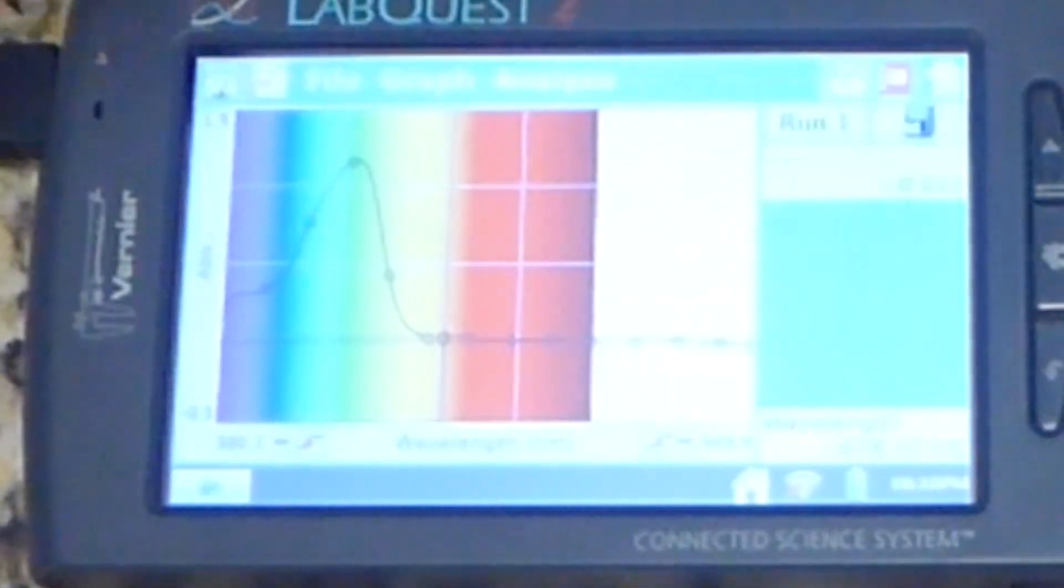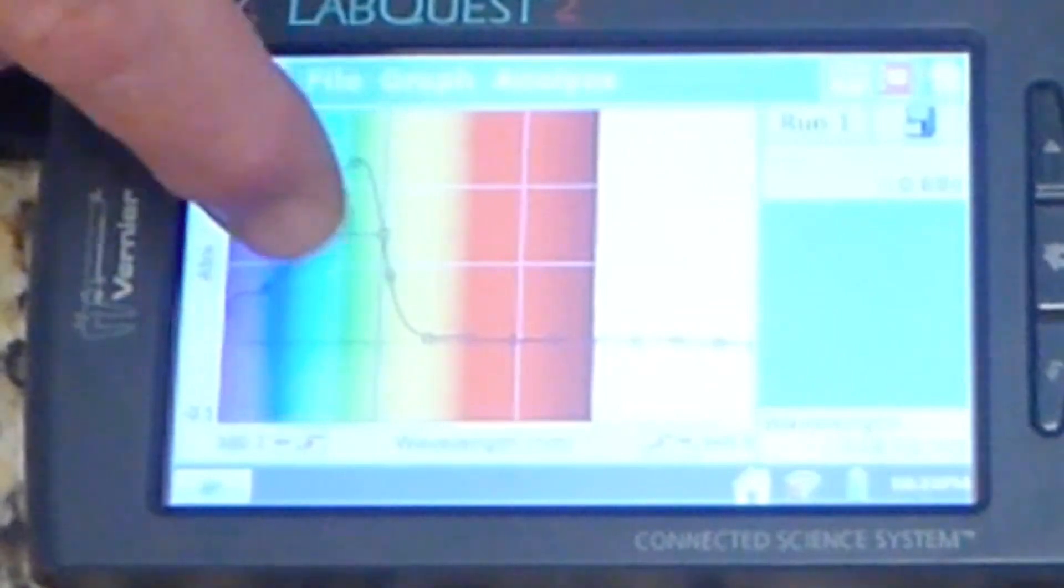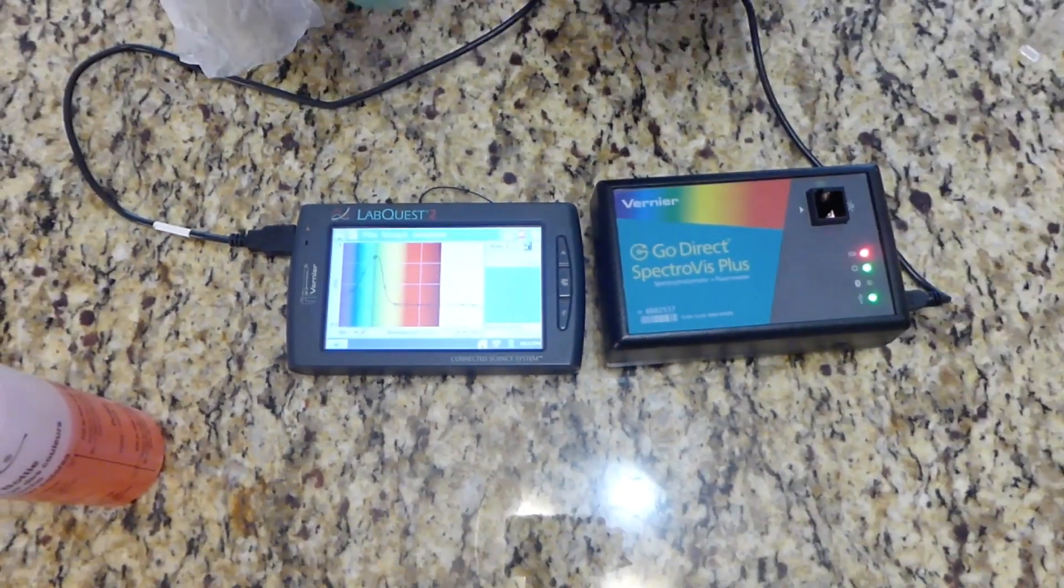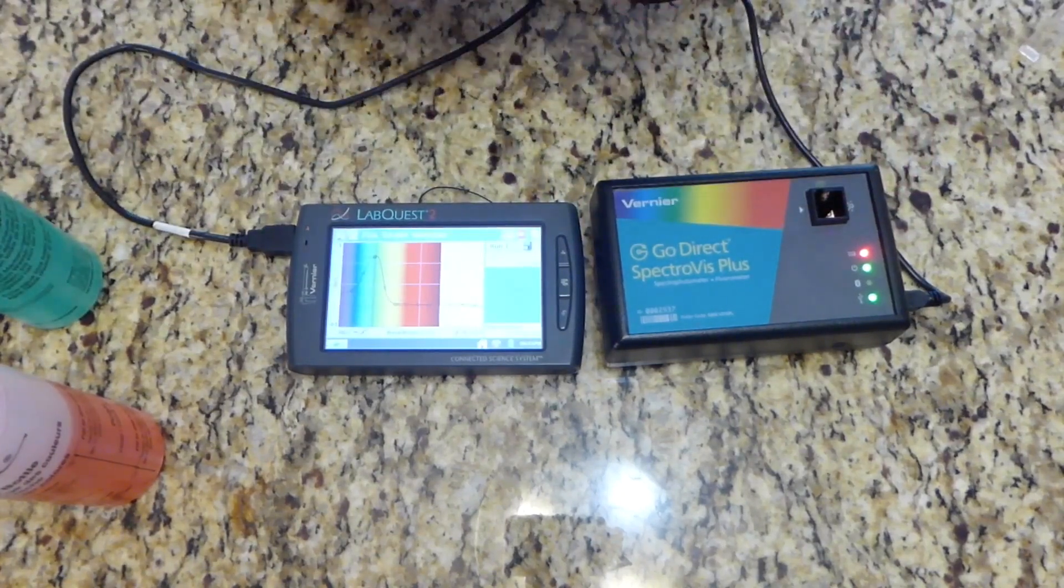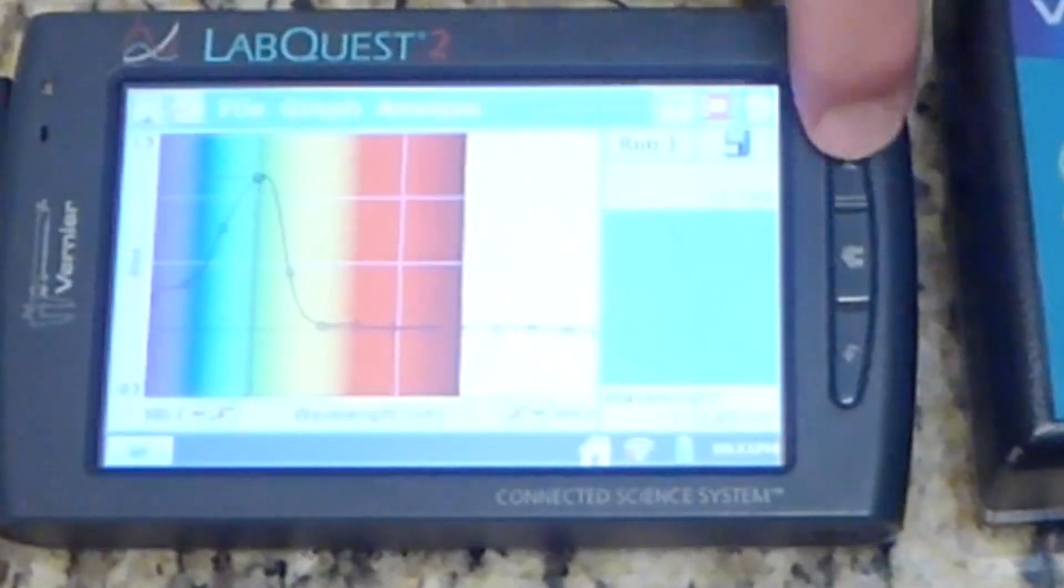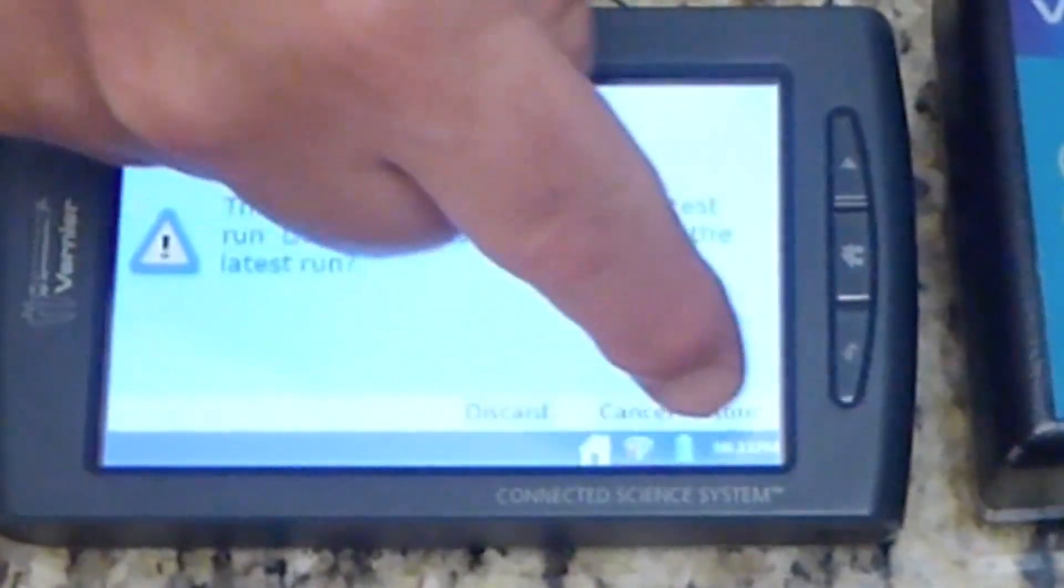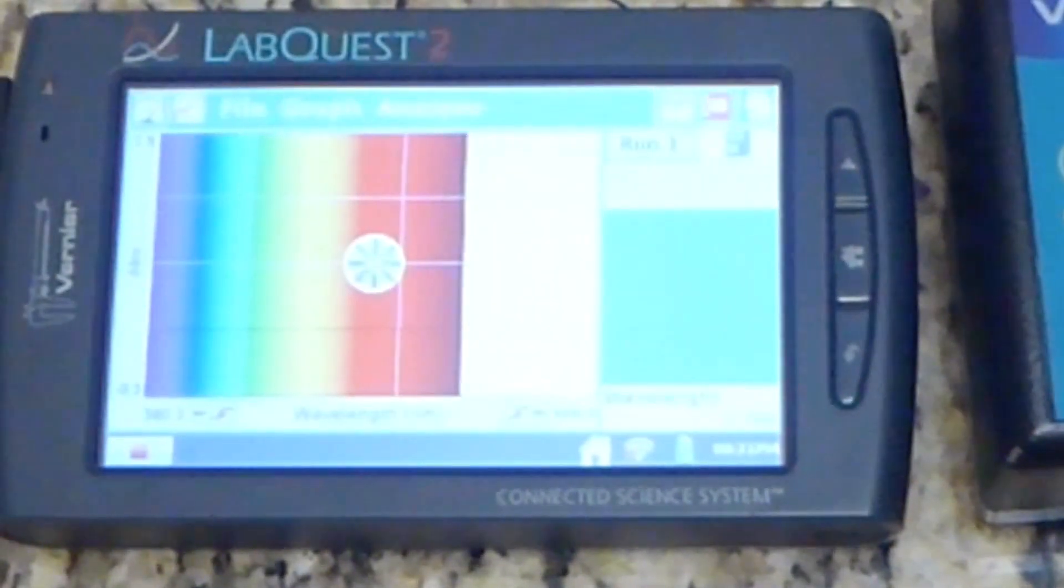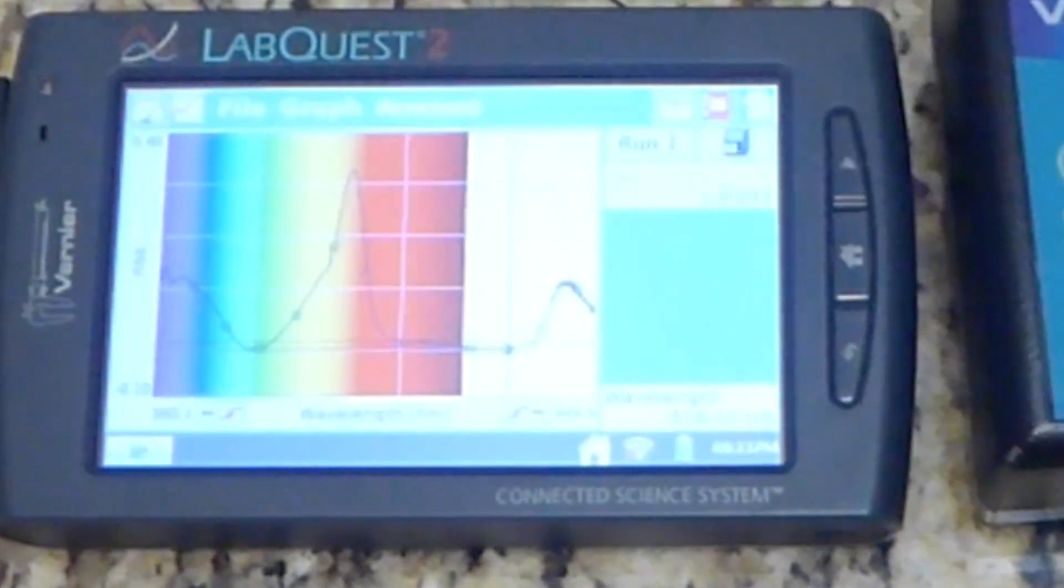And it will stop collecting data and you can see the data. You'll notice that it has a wavelength of maximum absorption. It has a readout of wavelength and absorbance. So by clicking around the screen, you can actually select different wavelengths and see what the absorbance is. If you want to do a different solution, you fill a cuvette, you wipe it down, you pop it in. There's no need to calibrate it. It only gets calibrated once. You push go. You can either store or discard the data. I choose to discard it. As soon as the graph is generated, you can push go again and that stops it. Then you can look at the absorption spectrum of that sample on the graph.